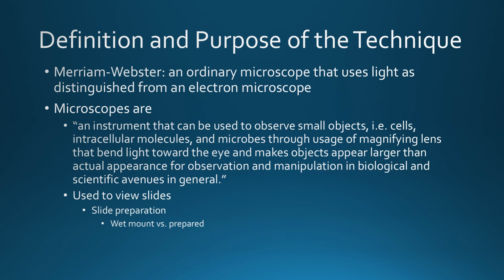That's what the definition of microscopy is. That's what microscopes are. Purpose of the technique is to observe very small objects.